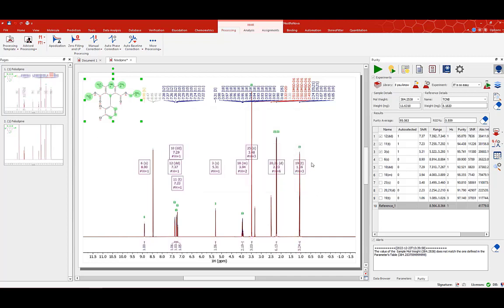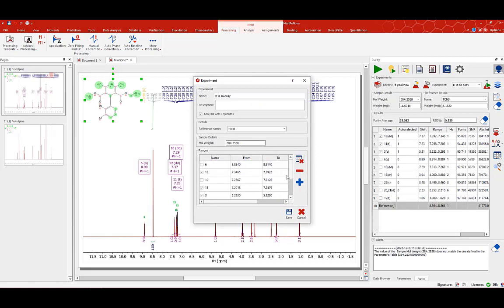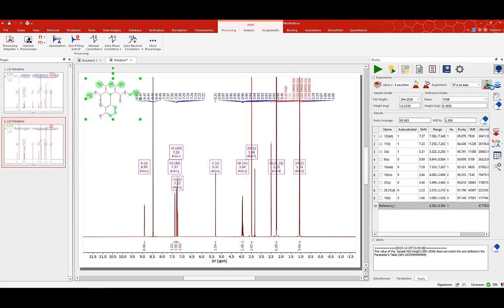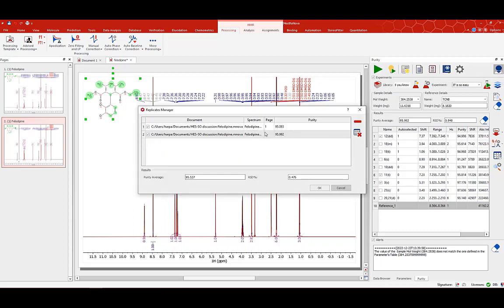What EMNOVA does now is it saves the parameters that it used for the first QNMR, and I can modify all of these manually. So when I go to the second experiment I can just apply the experimental values that I used on my first spectrum and it will do exactly the same thing. After it finishes I can see the results of both my replicates, the average and the RSD.